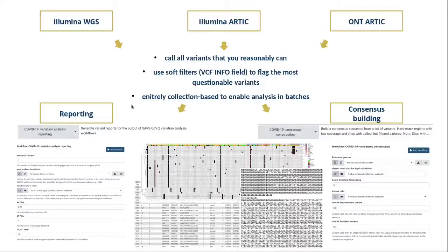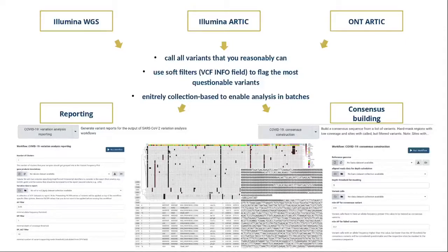As the next step after these variant calling workflows, we built two additional workflows: one for variant reporting and one for consensus building. They work on collections of VCFs produced by the upstream workflows and generate batch-level output. The reporting workflow generates overview plots across all samples in a batch, letting you quickly pick up interesting patterns of variants, and also generates per-batch variant reports. The consensus building workflow generates multi-sample consensus FASTA sequences for genome surveillance projects and lineage analysis — for example, to find out whether these are alpha, beta, gamma, or delta lineages of the virus.